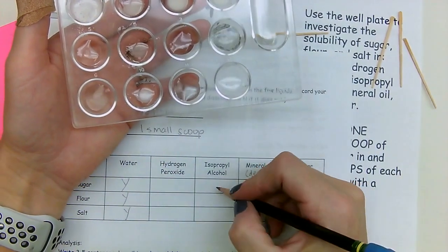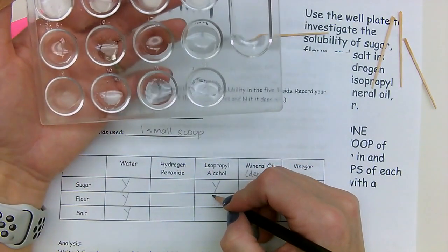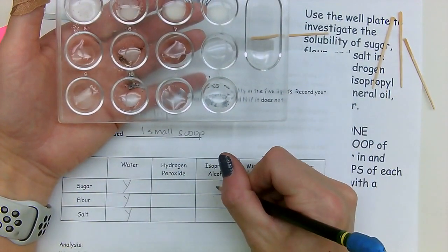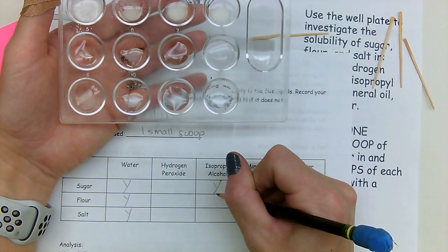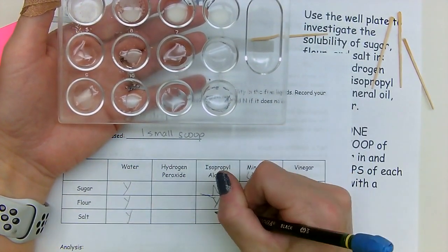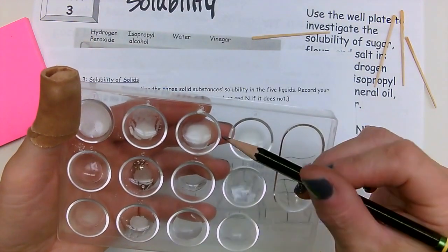So this one is isopropyl alcohol. So yes for the flour, no. Oh, sorry, sugar's on the top on this one. Sugar is a yes. No, sugar is a no. Flour is a yes. And salt is a, I mean, now that I'm looking, the flour is not dissolving.